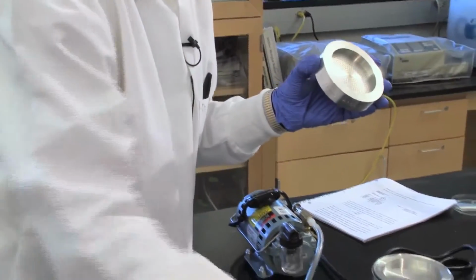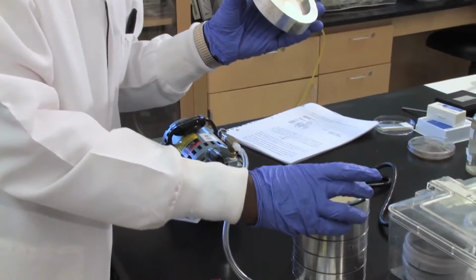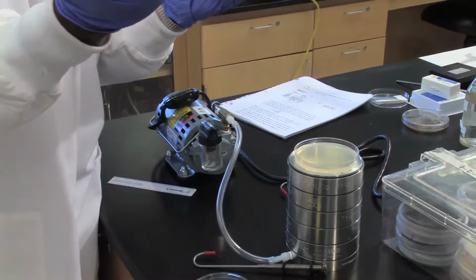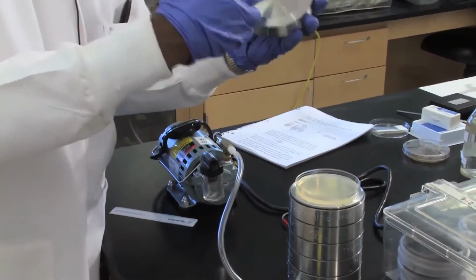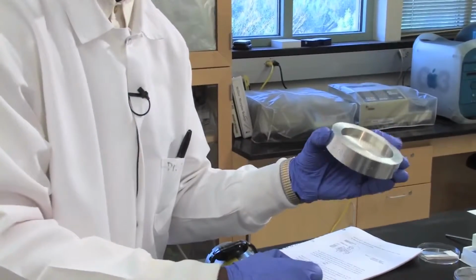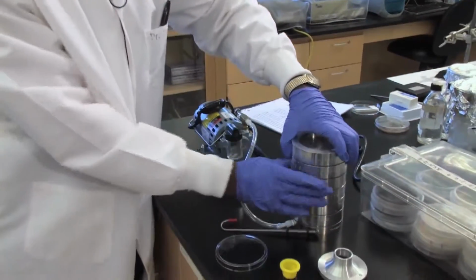So we put a Petri plate underneath of it, so that when the air gets sucked into the orifice, all the particulate get impacted through this perforated ring onto the medium. So we do so for each layer. So this is the first one.